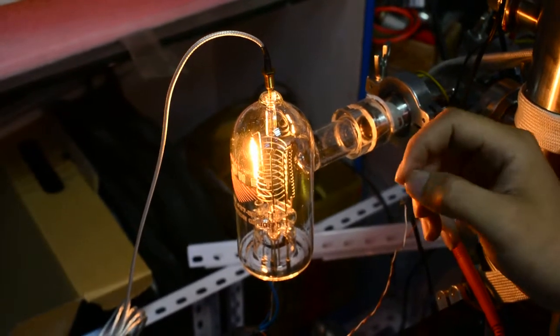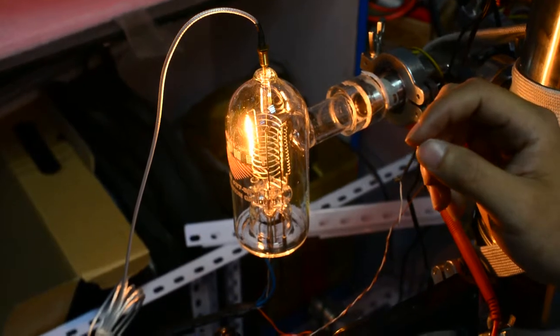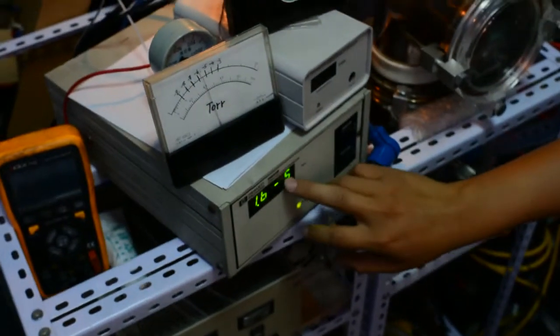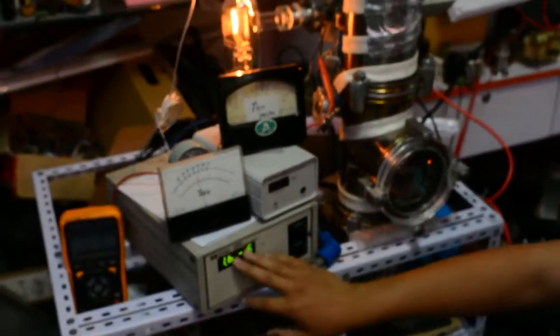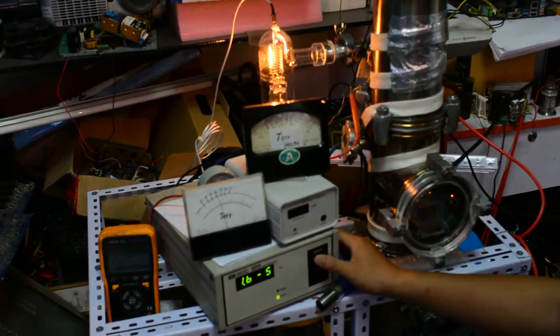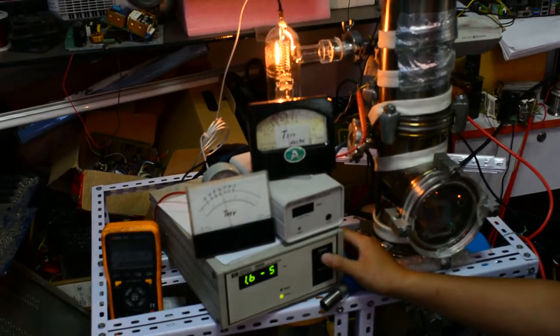It can cause a problem by the measurement readout. When it is dropping down to the 5 to the minus fifth torr, I can use the degas operation. I will show you how to do it.